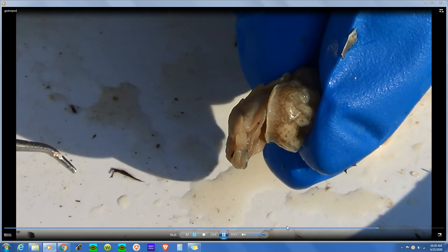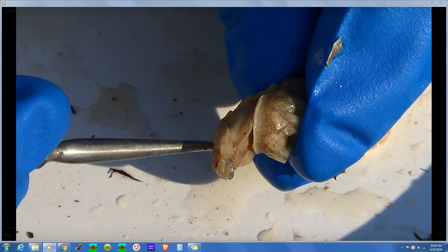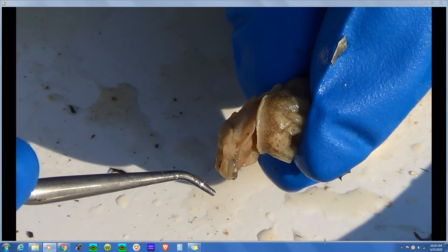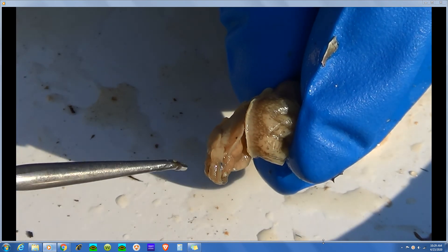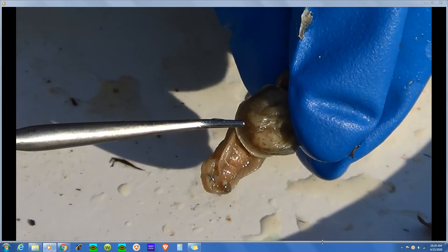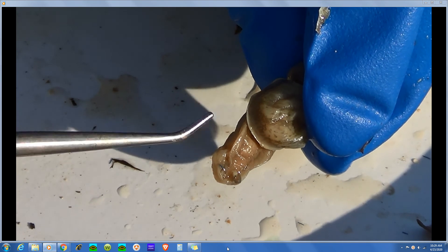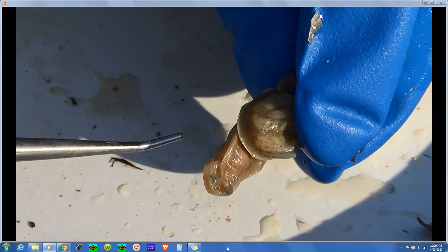There we have a gastropod — belly foot — wide and flat on the belly side of the animal. Highly cephalized, two sets of tentacles for tactile and chemoreception, another set of tentacles that are eye stalks with lenses that produce a good image. Snails produce a shell; slugs do not. Otherwise they're exactly the same in terms of their body form — they're both gastropods.